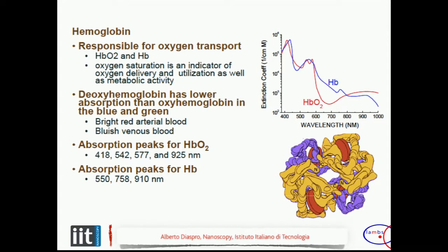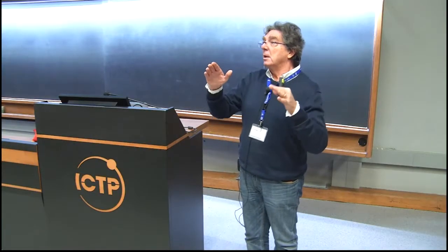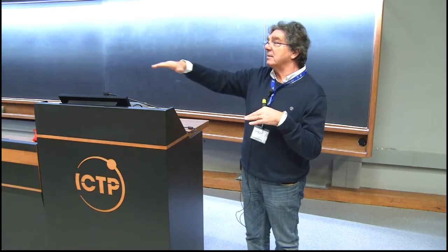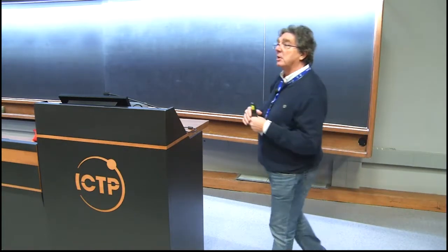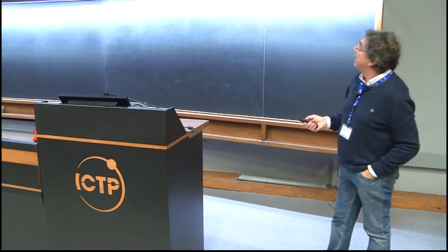And we don't want to do this. So the main reason we are using the optical microscope is because I don't have to ask you to become solid, to be physically sectioned, to be metallized, and to be injected with electrons in order to have some contrast. I can simply follow what's going on using light.